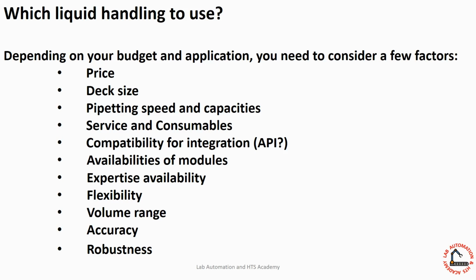For example, with some systems you can go to the nanoliter volume. But the problem would be that it's less flexible and you can only use certain consumables that are available from that company. So that is also important, but I think it's obvious because volume is the first thing that people usually think about when they design the assay.